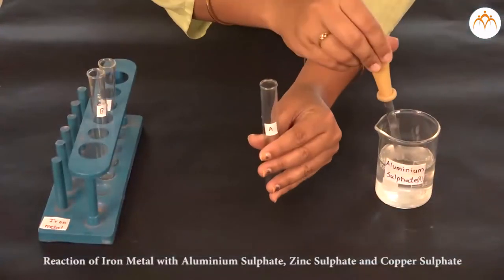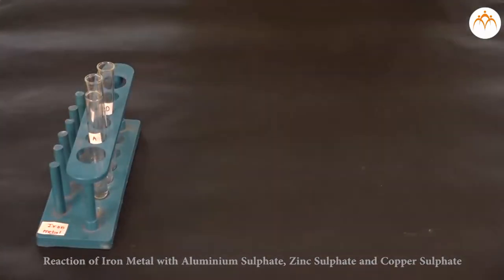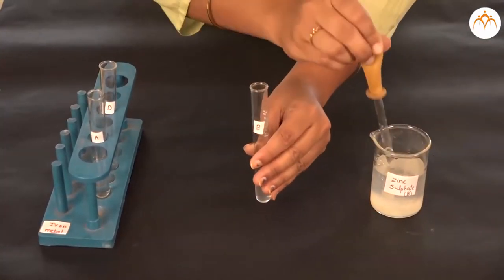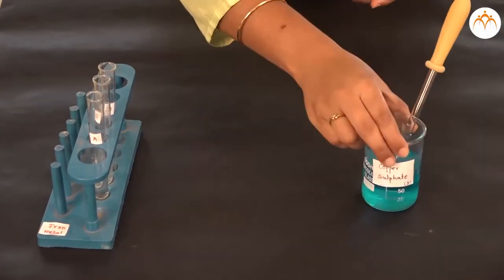Take copper filings and add to aluminum sulfate, zinc sulfate and ferrous sulfate solutions. Observe the changes.